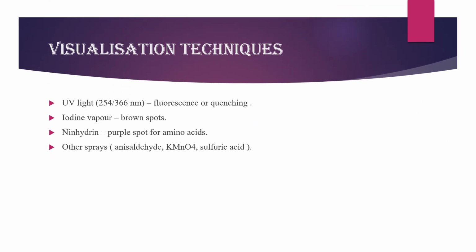TLC spots can be seen using various visualization techniques. These include UV light at 254 or 366 nanometers, iodine vapors, ninhydrin for amino acids, and other sprays like potassium permanganate and sulfuric acid.